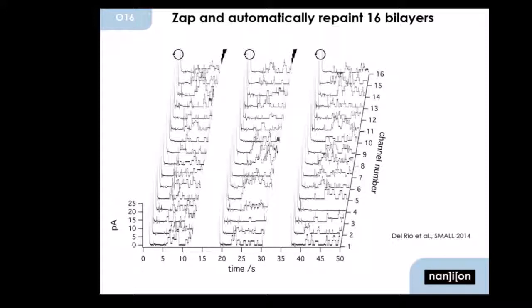You can also zap these bilayers and, just by a push of a button, repaint all 16 of them. Of course, you wouldn't do that on purpose during an experiment, but if you add your protein or apply high potentials, what normally happens is that some of these bilayers break. It's really easy, just by a push of a button, to get all these bilayers back.